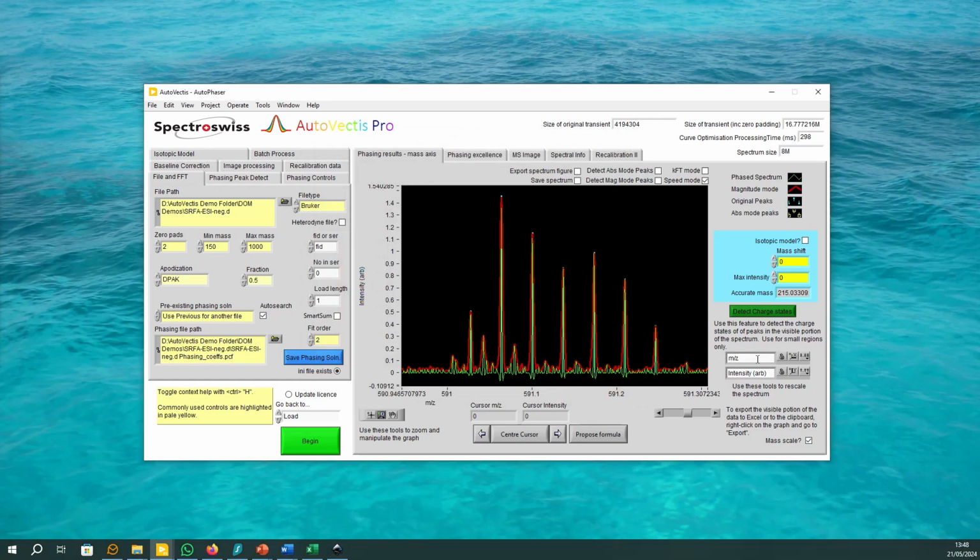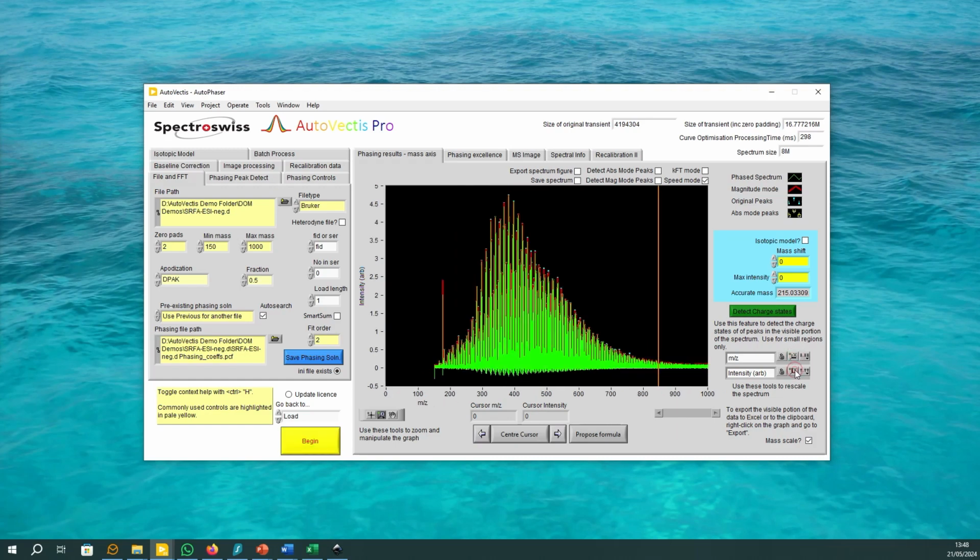In the vast majority of cases, the ab initio route is the only route you will ever need, but you can always re-refer to this video if you want to attempt processing using a different approach.